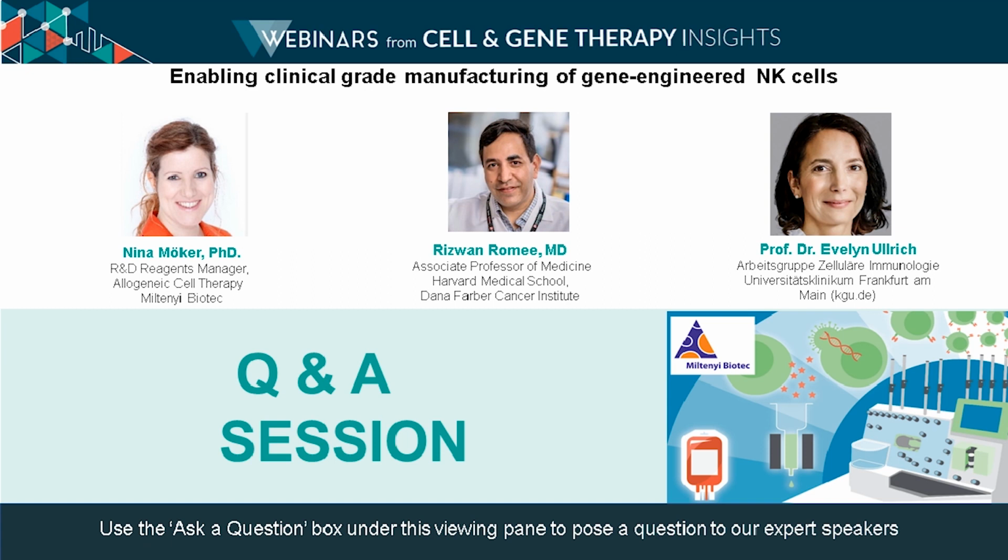So good correlative science is very, very important, because NK cells are probably 10 years behind T cells, and there's a lot to learn. I'm not saying we have learned everything about T cells, but with NK cells there are a lot of unknowns right now, and having the right analytical tools to allow us to do a deep dive after adoptive transfer is also, in my opinion, very, very important.